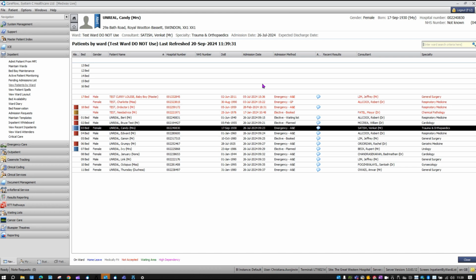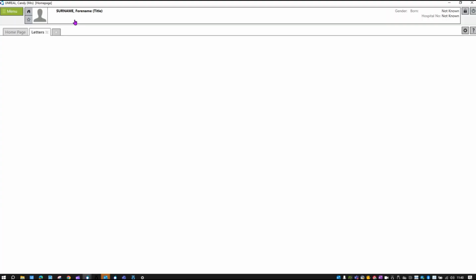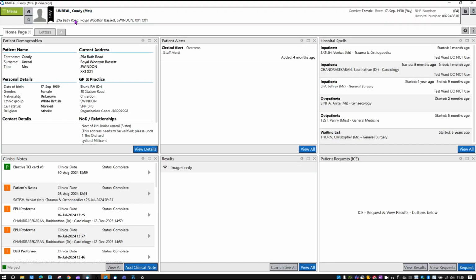Hello, in this video I'll show you how to place a histopathology request for a patient. The starting point in this case is an inpatient ward and I've already got the patient selected. That means her details are at the top of the page and I can click to go to the electronic home page for the patient. So I click the home button to open up her electronic home page.